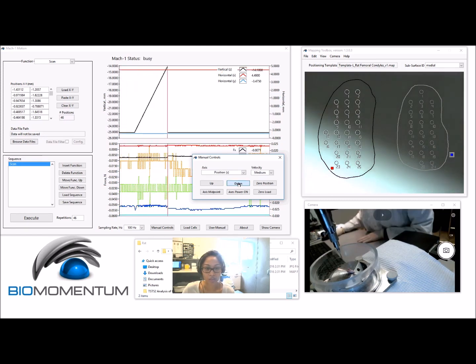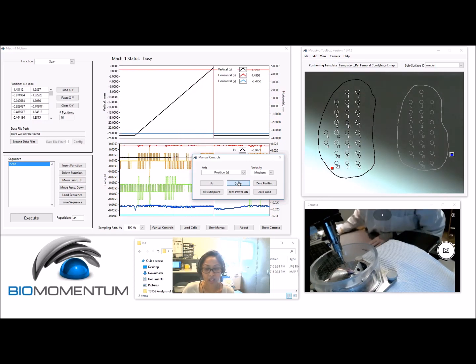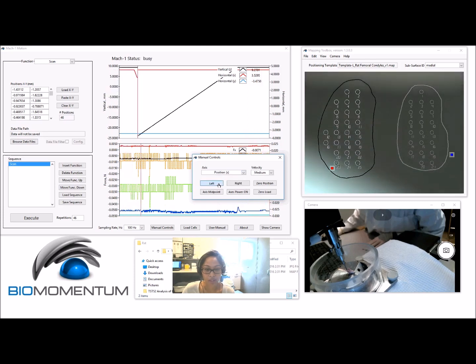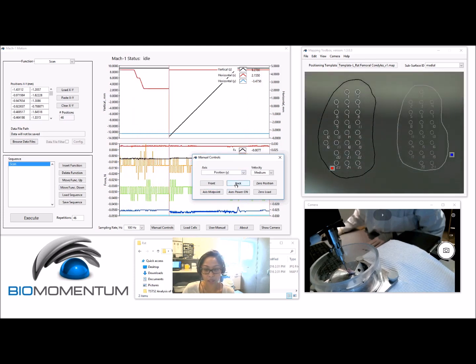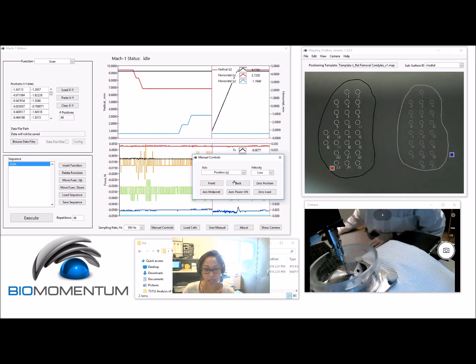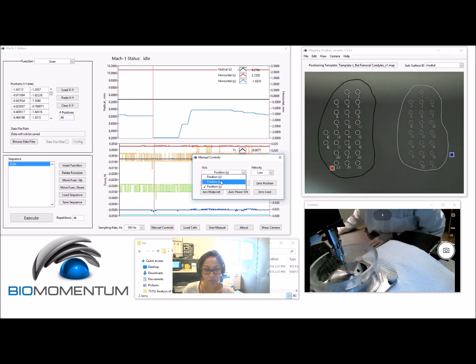Lower the spherical indenter towards the surface. With the sample testing chamber mounted onto the MAC1, move the stages so that the center of the MAC1's indenter is positioned just over the first reference mark.